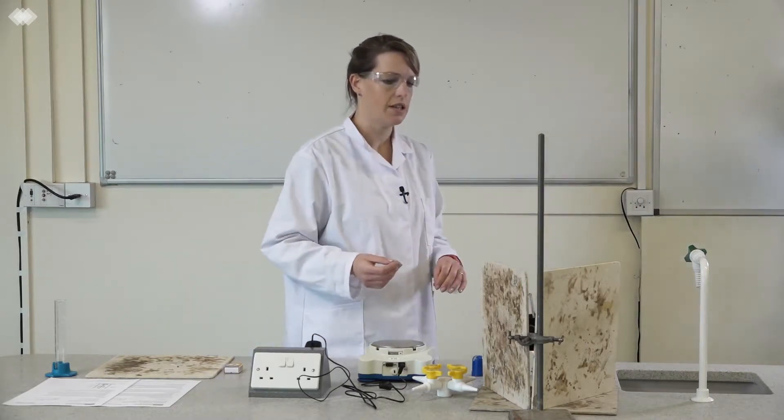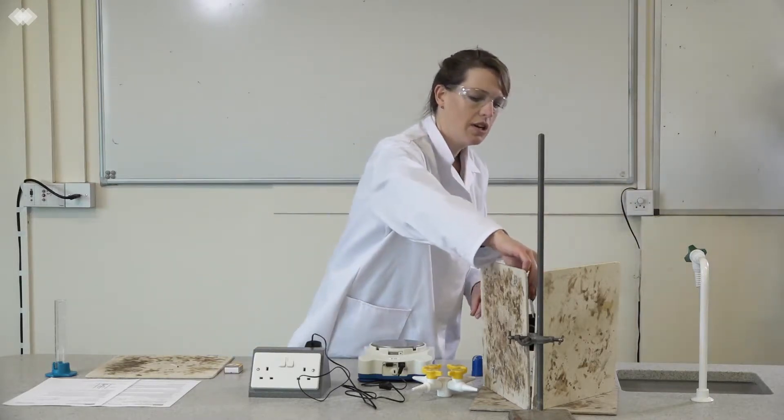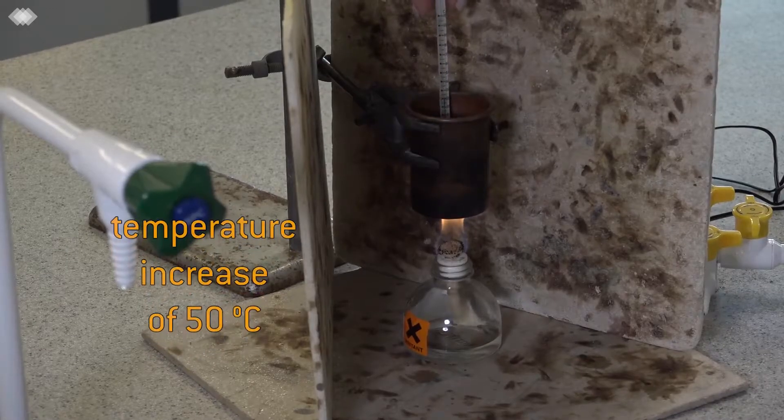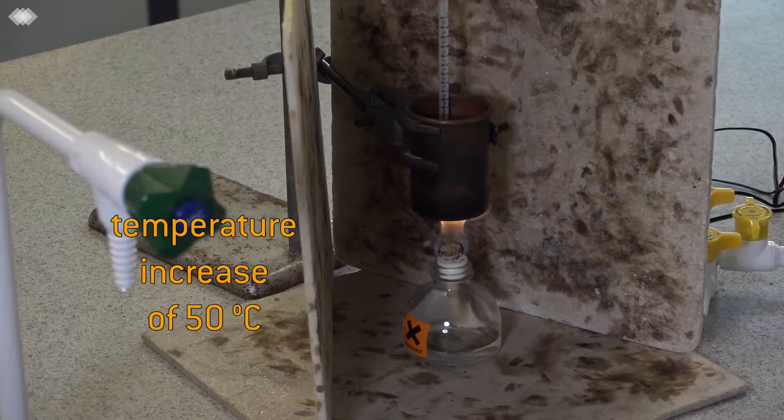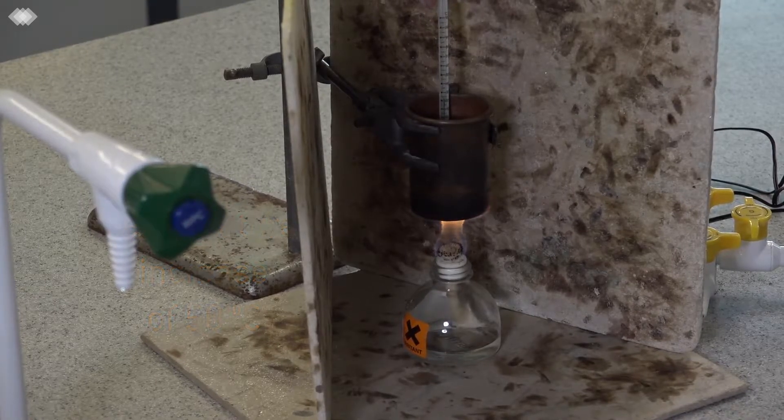Now you heat it until the temperature is increased by about 50 degrees. So if we've got a starting temperature of 20 degrees, we want to heat it until it gets to about 70 degrees.